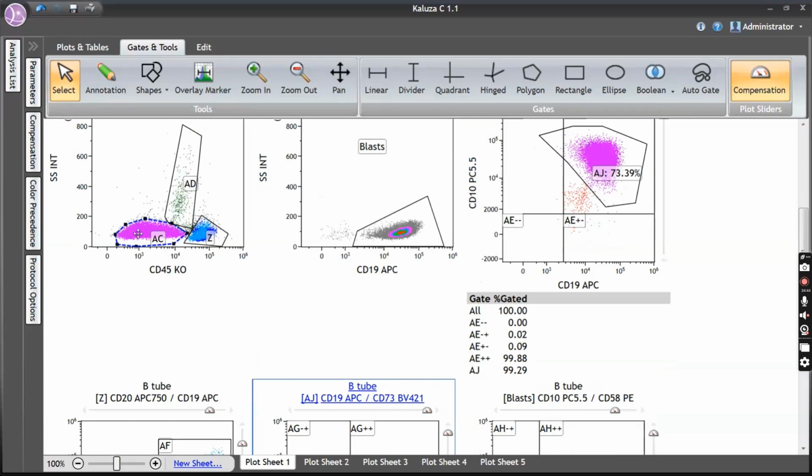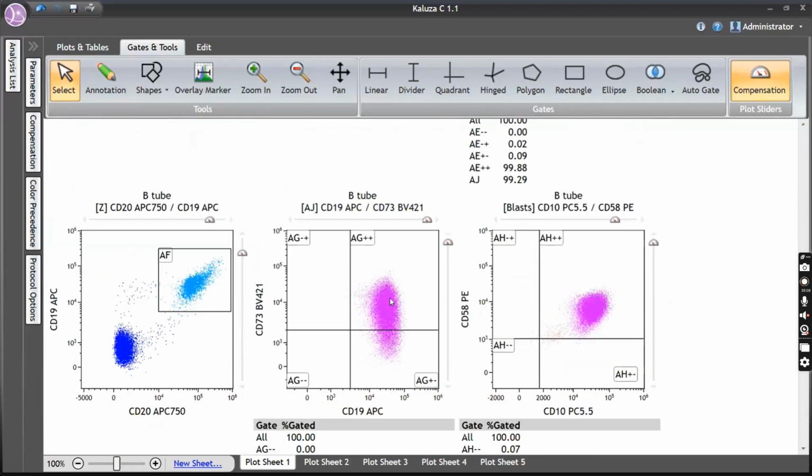Second point, side scatter. I may not take that point, because hematogones can show side scatter, and differentiating a B lymphoid blast from hematogones by side scatter is very difficult. CD45 pattern, yes, stage 1 can fall here. Negative CD45 is not likely in hematogones, so that is fine, but still that is very tough. Any other points? That homogeneous is something which I will take. Any other point?